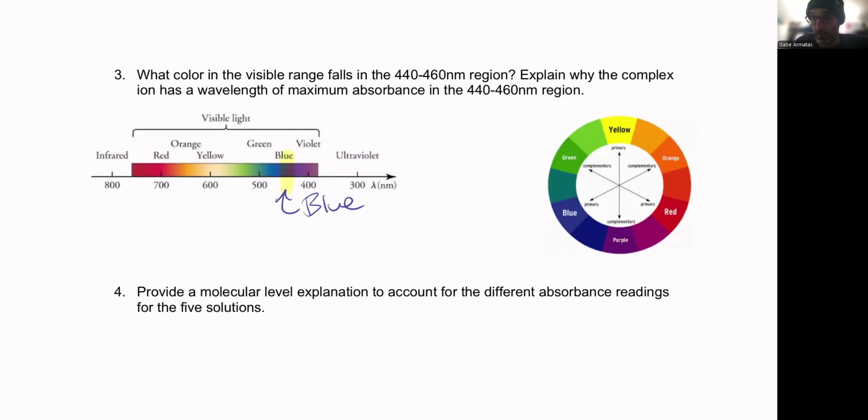But your thing didn't appear blue, right? That was, in fact, a deep red is typically what we see when we look in that 450 nanometer region. So what's going on there? Well, if we think about what is happening, light passes through and gets absorbed. This blue light is getting absorbed. And so what do you see? Well, you end up seeing the complementary colors.